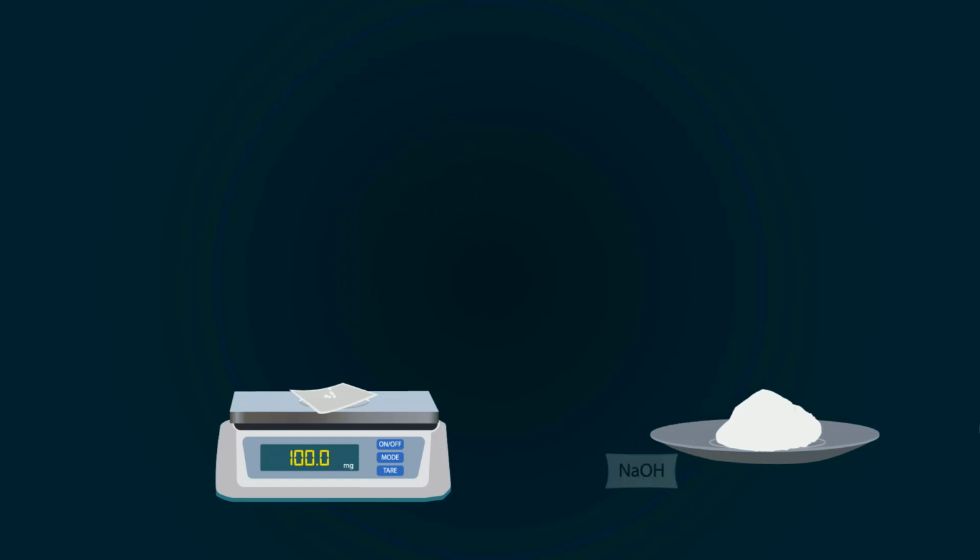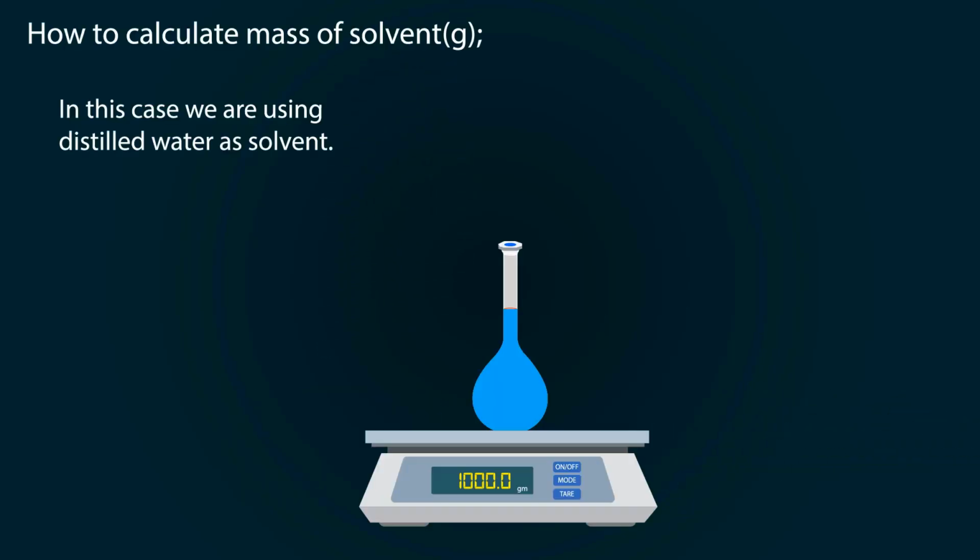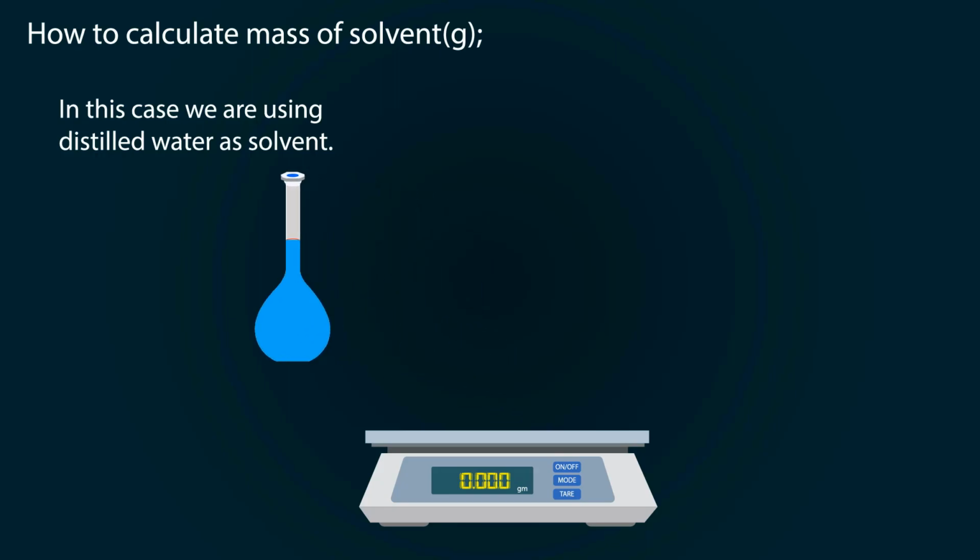In this video, you will learn how to prepare 100 ppm solution of any solute.